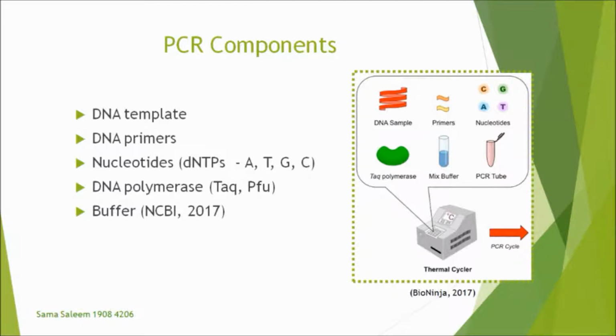Hello, my name is Sama and I'll be going through the procedure of the polymerase chain reaction as well as the current applications of the technique. To begin with, how does the polymerase chain reaction work? Well, firstly, what is needed for PCR to commence?